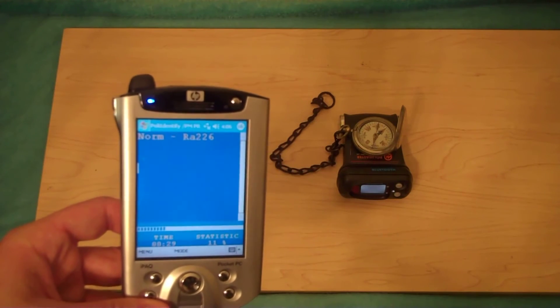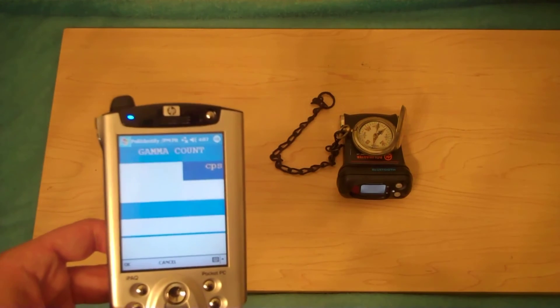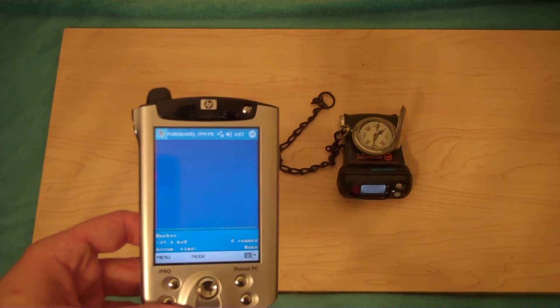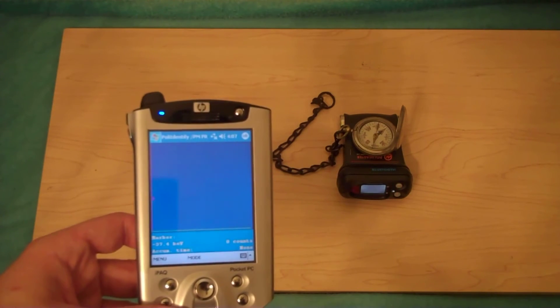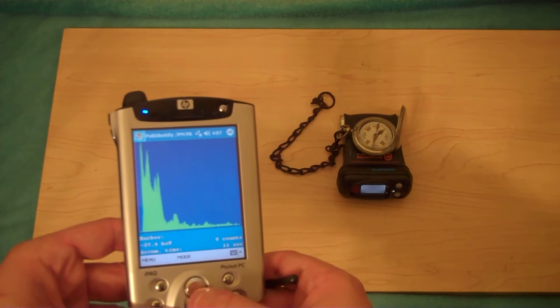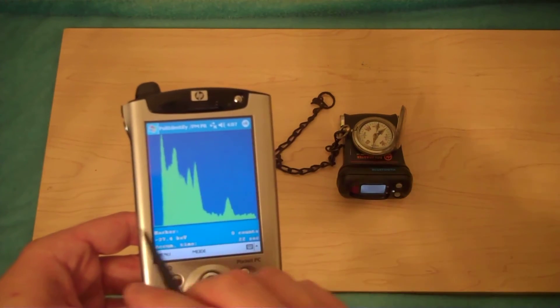It is a naturally occurring isotope — in this case it's in an unnatural format, but it technically comes out of the ground. Let's do an actual gamma spectrum. You have to give the gamma spectrum a few seconds. This is going to do a wide spectrum from around 30-40 keV all the way up to about 3,500 keV. Look at it go. We can zoom in and see the peaks as they slowly start to rise and form. If you set this down for about 20 to 30 minutes, you'll get a really good spectrum.